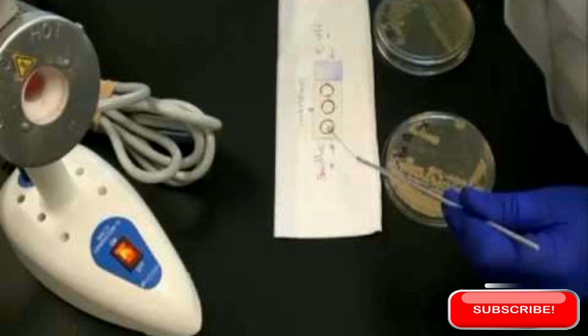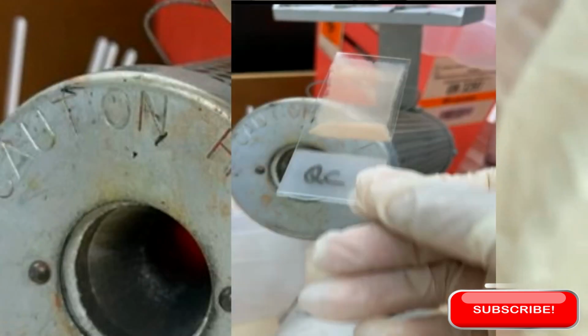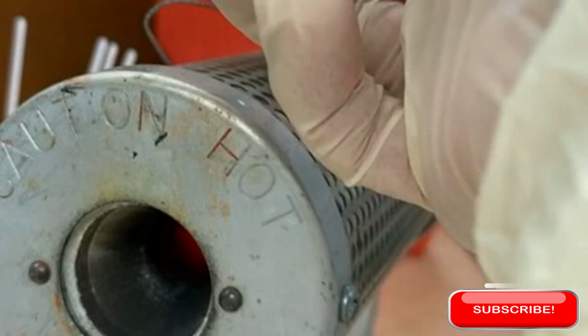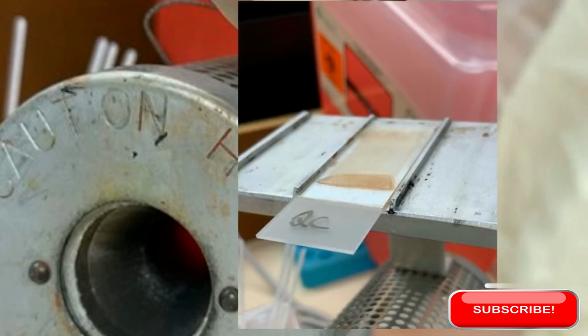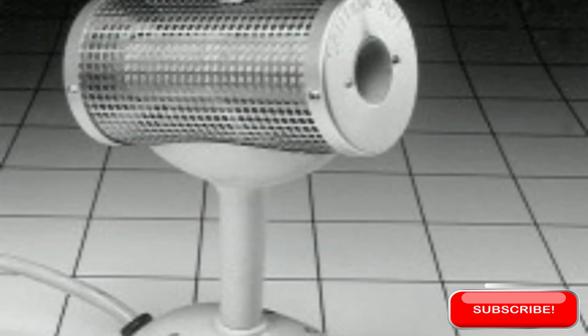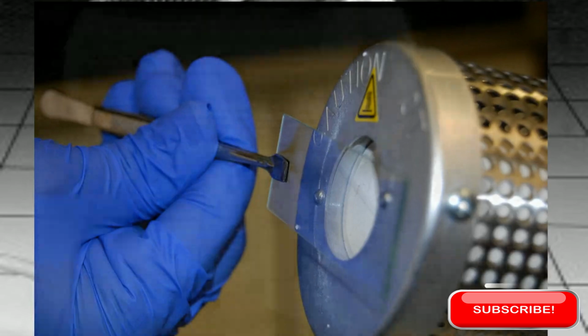For any stain, you must first smear the sample to be stained onto the slide. After making the smear, then heat fix the bacteria on the slide using the incinerator. Incinerator is an infrared heat sterilizer. It is safe and simple to operate without fire and ideal for use in the field of microbiology.